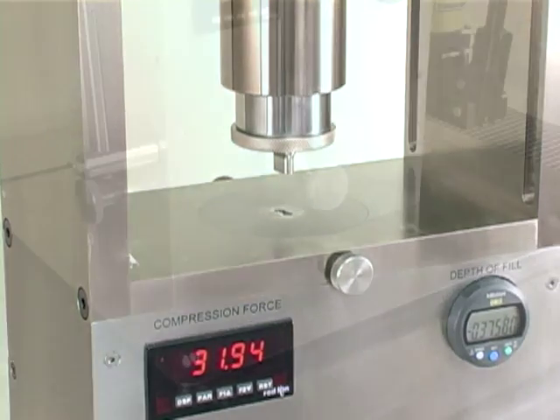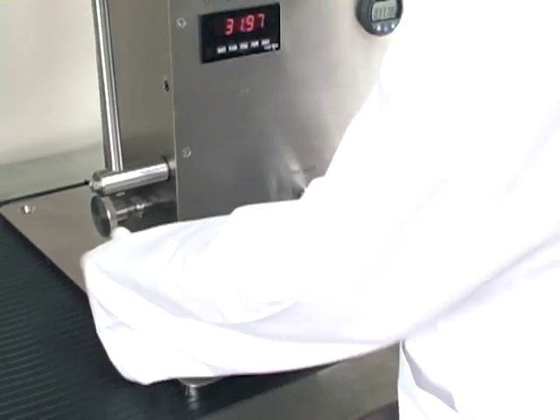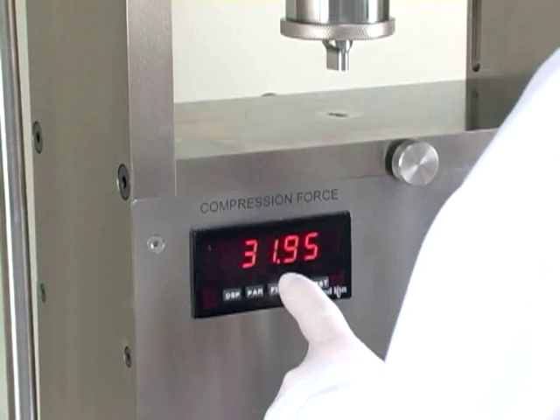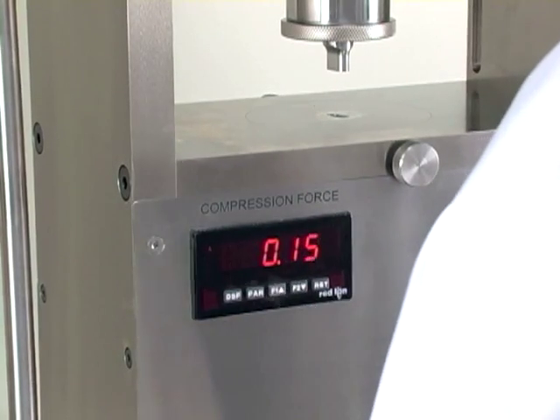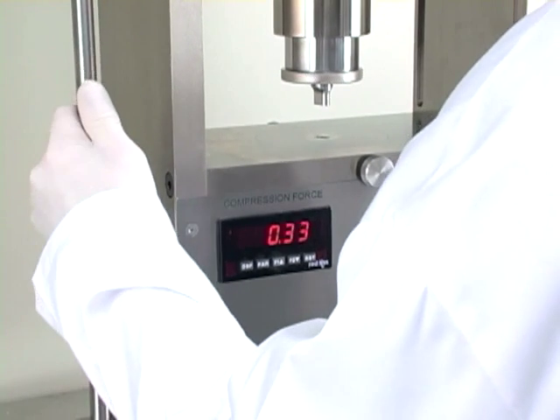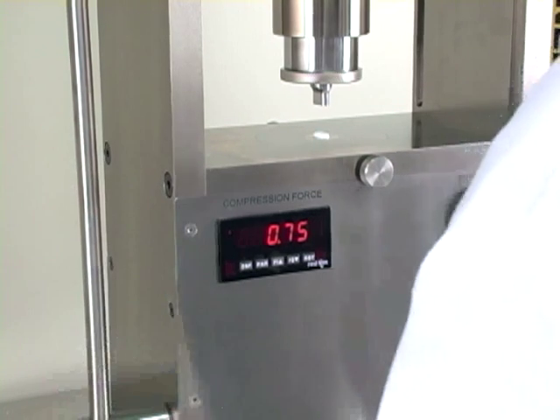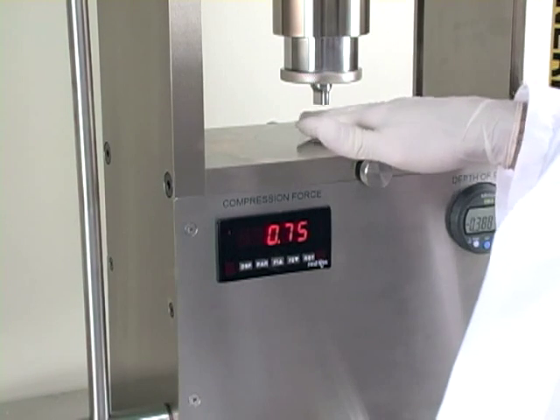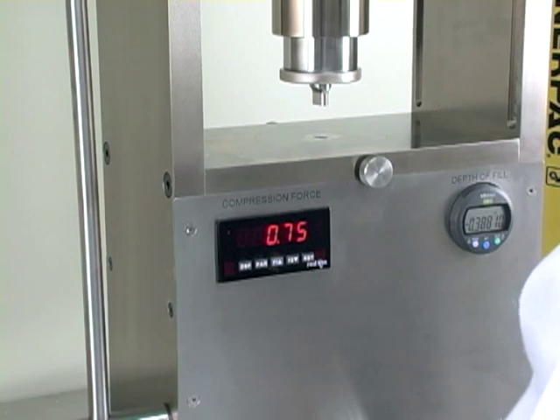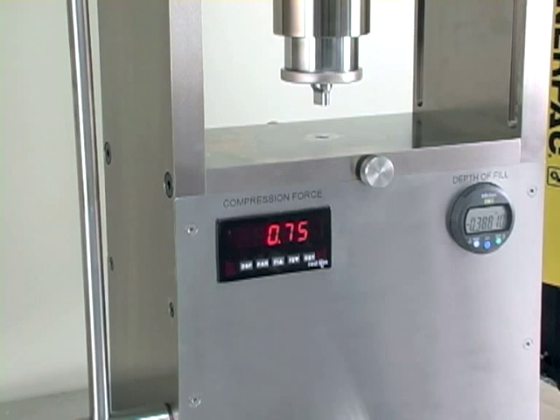Now it's time to eject the tablet. To check your ejection force, loosen up the gib lock screw, back off on your depth of fill, and press the F1 key to reset the force on the compression force meter. Then we pull back on the ejection lever. Your compression force meter is now displaying your ejection force and you've made a tablet. This concludes our demonstration of the NPRD-10A laboratory tablet press.